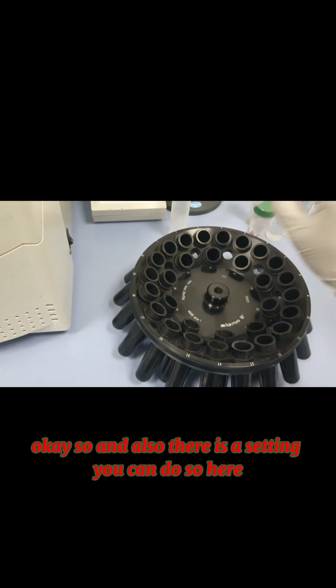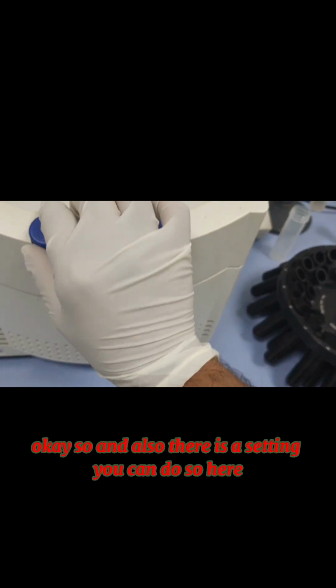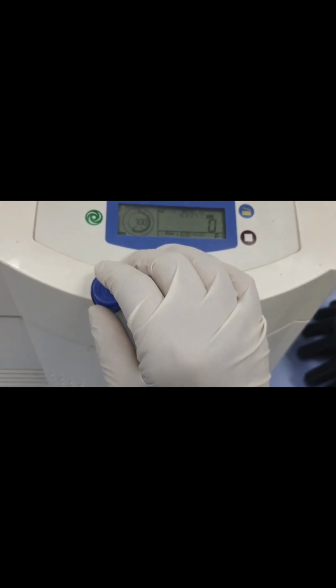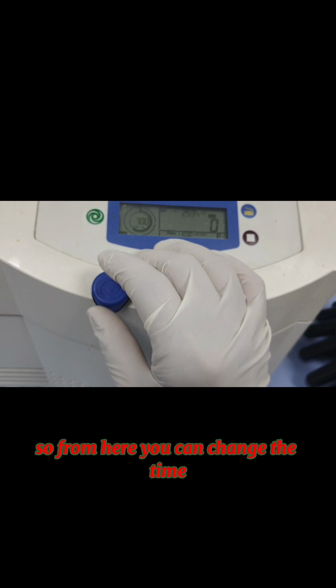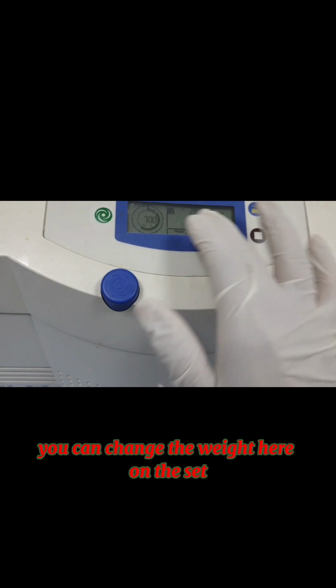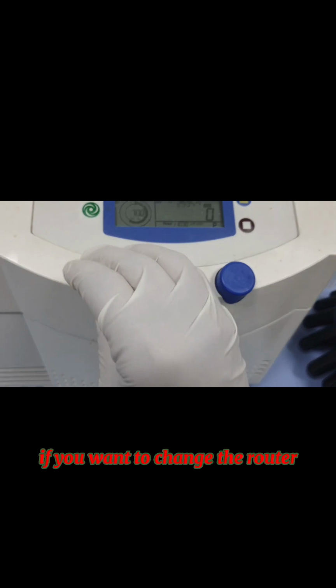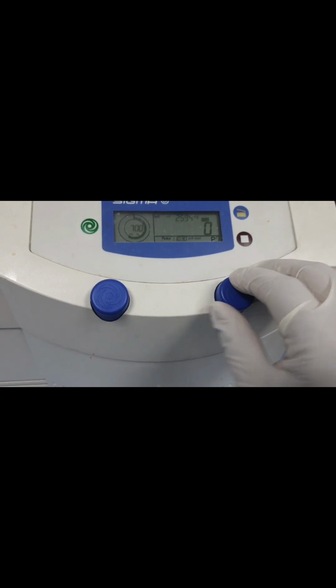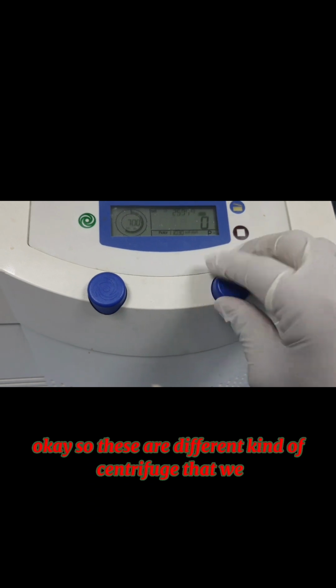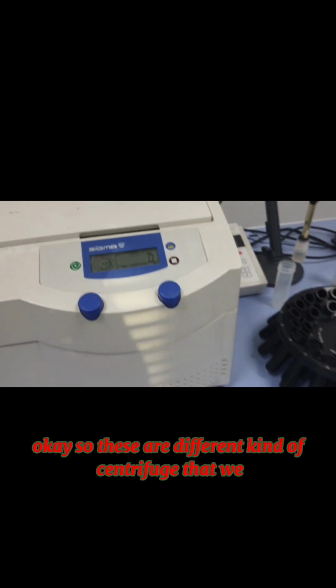There is also a setting you can do. From here you can change the time, and these are different kinds of settings. You can change the weight here on the set, and you can change the rotor if you want to, and from up here you can change the setting. So these are the different kinds of centrifuge that we have in our laboratory.